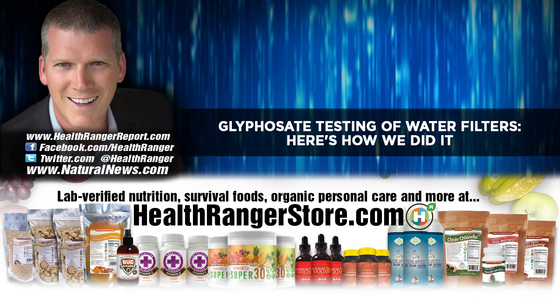It's not a regular factory-run column. Like most columns, just off the shelf. You buy it, you get it the next day, right? These columns, you order it and you wait. You sit there and wait for 2 months. And then you're lucky if you get it. Well, this column, this mystery column, turns out that if you use the right pH with it, the right chemistry, it produces astonishing chromatography peaks for glyphosate, the likes of which we have never seen in any other method, not even close. The chemistry of the column is just incredible.